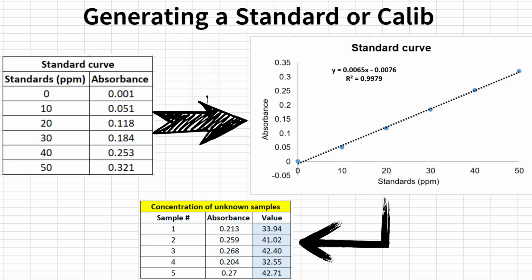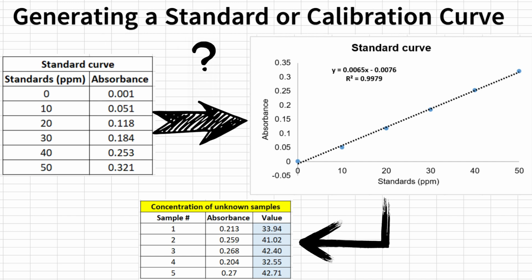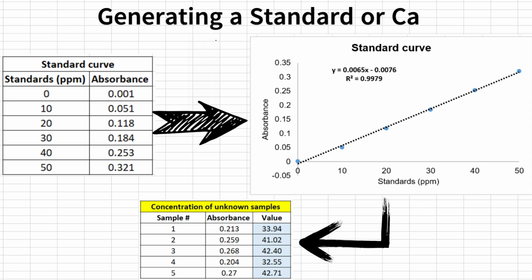to generate a standard curve or calibration curve to measure the concentration of unknown samples.